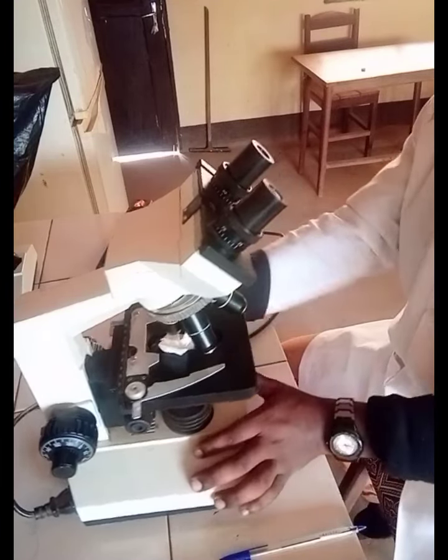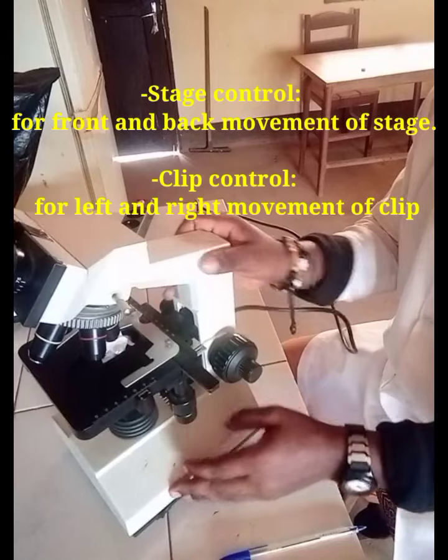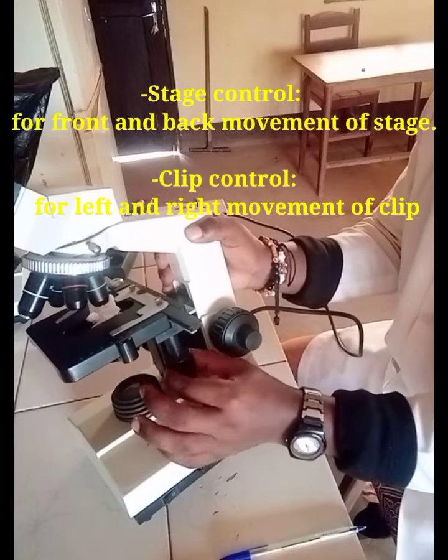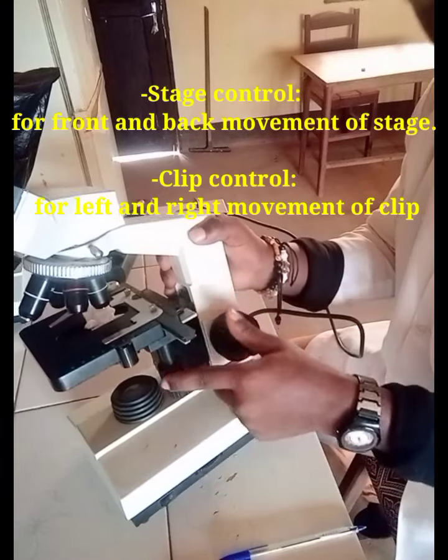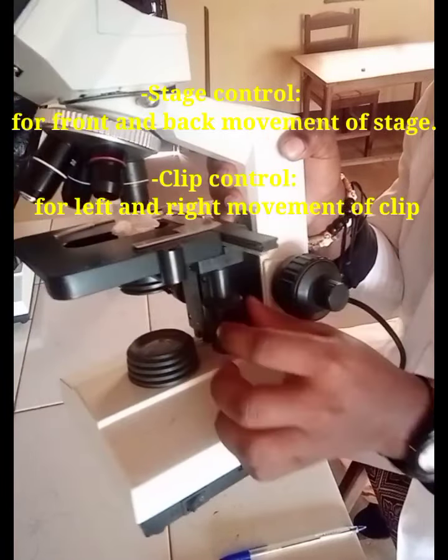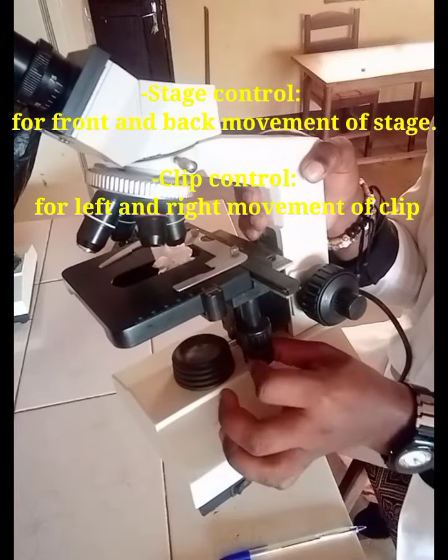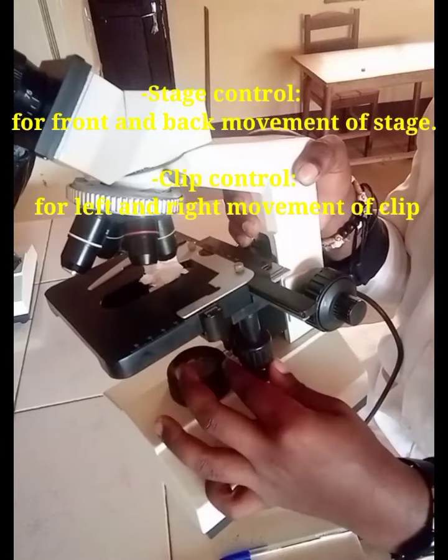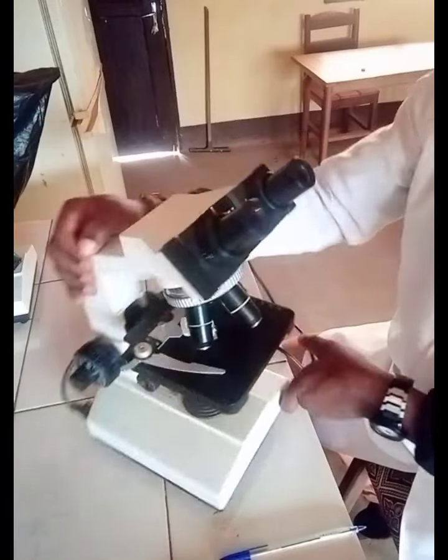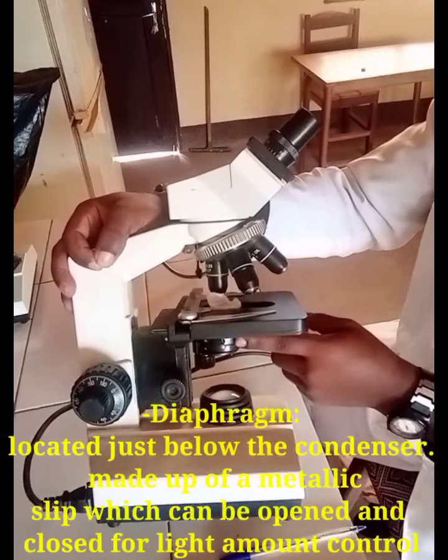Now, attached to the stage, just below the stage, we have what we call the stage controls. Here is the stage control. It moves the stage forward and backward, as you can see, and just below it is the clip control. It moves the clip left and right. Clip control, stage control. And so below the stage we have what we call the diaphragm.